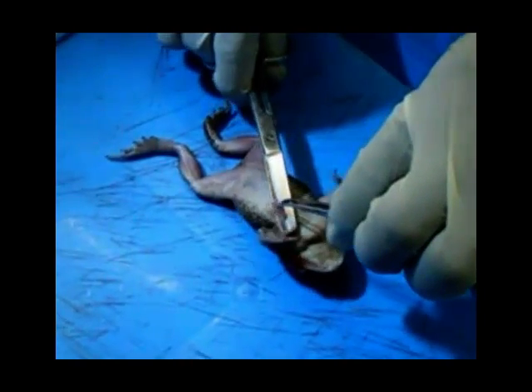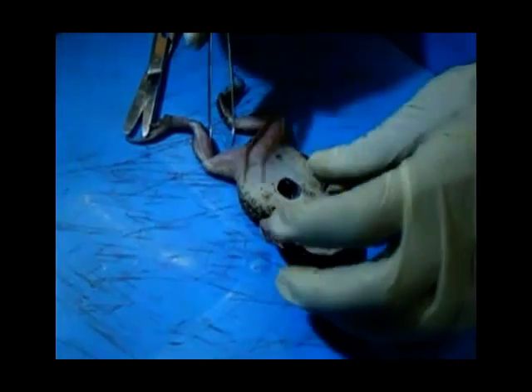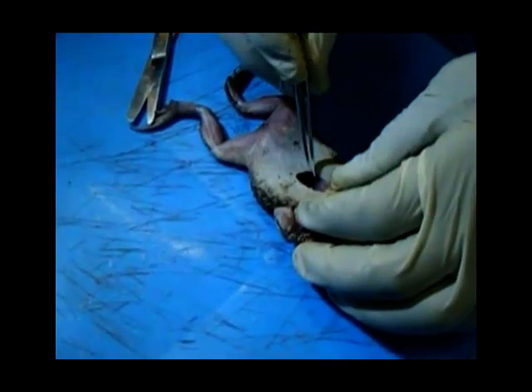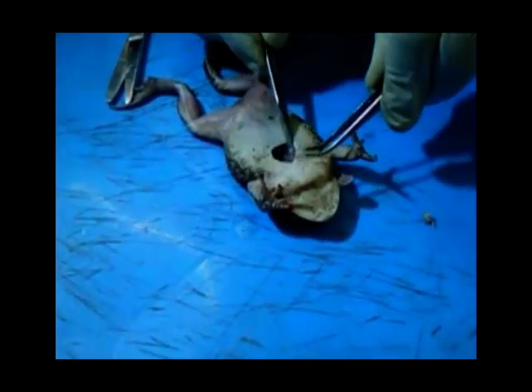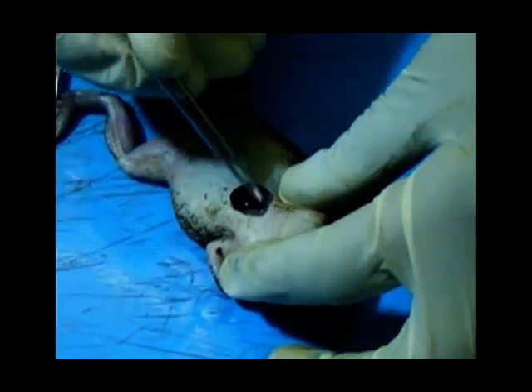The frog is laid with its ventral surface uppermost on a cork board and then the skin removed from the pectoral region. The exposed xiphisternum is then removed, creating a window in the body wall allowing the heart to be seen. The pericardium surrounding the heart is cut away and the heart exposed.